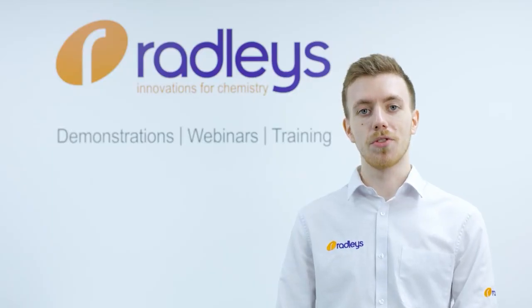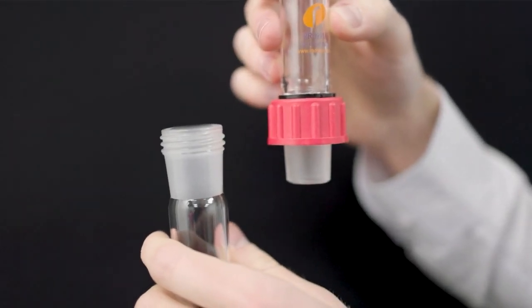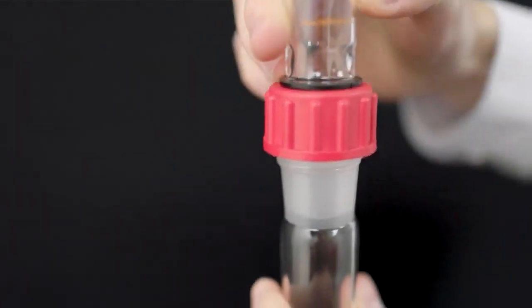We're all too familiar with the frustration of dealing with stuck joints, so we include Rodevis fittings on many of our products. When it's time to disconnect the joint, these threaded fittings press the glass apart evenly and quickly without the risk of breakages and spills. You can check out our video on Rodevis fittings on our YouTube channel.